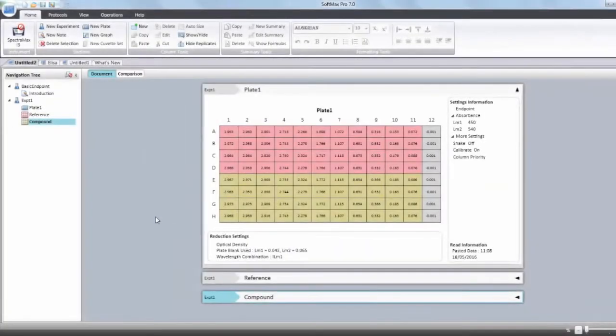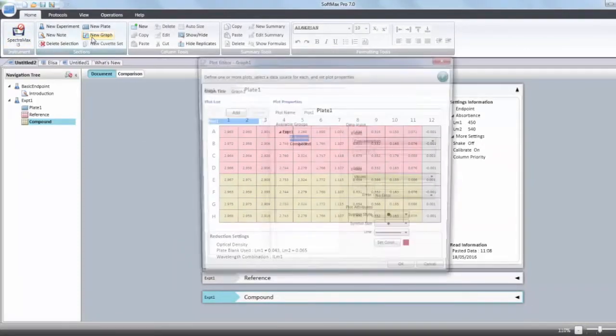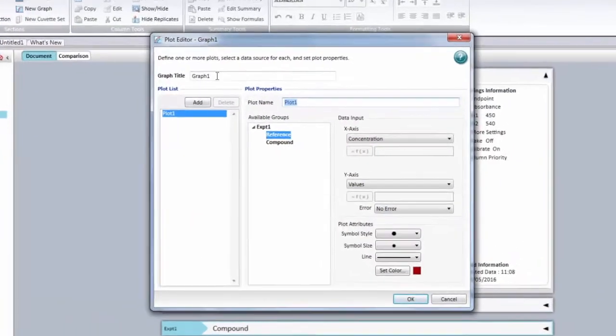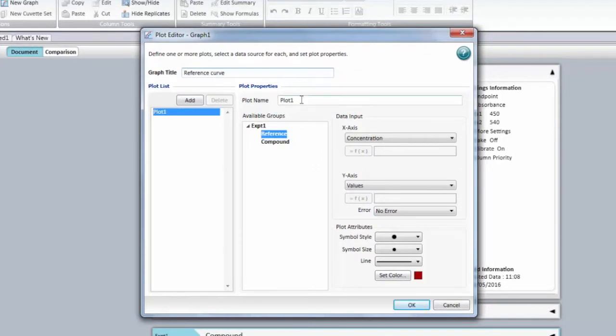So in order to add a new graph section to an existing protocol, you need to go in the top menu into the section area. You need to select new graph. The plot editor window will appear and you can change the name of the graph. You will have one plot by default and you're going to be able to add some if you need to.